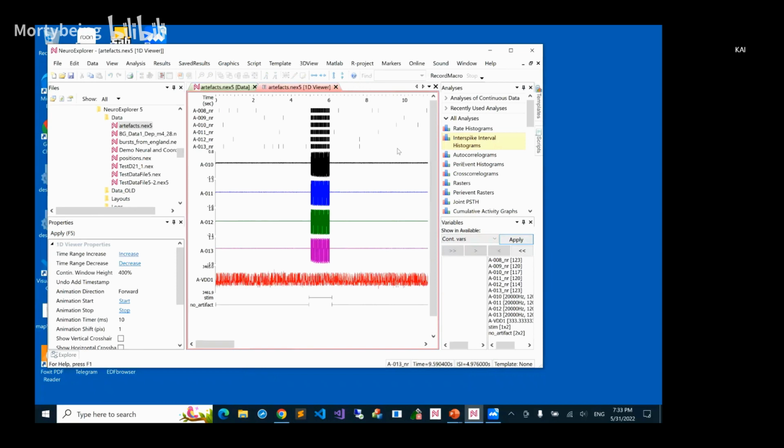I mean, the time of the noise is pretty long. But we also want to do the analysis. So maybe we need to filter it out. We need some kind of noise template to filter it out from the raw data and then continue the analysis.